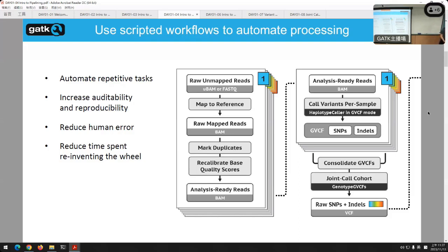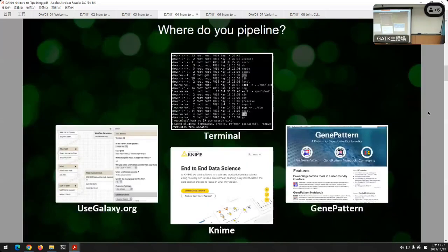So you can record very precisely exactly what process was executed on your data, and go back and check the whole pipeline, what happened at each step. So basically, it saves time, reduces errors, and makes things a little bit easier to automate those pipelines. So that's what we'll be talking about today. And there are a lot of different ways to do that.